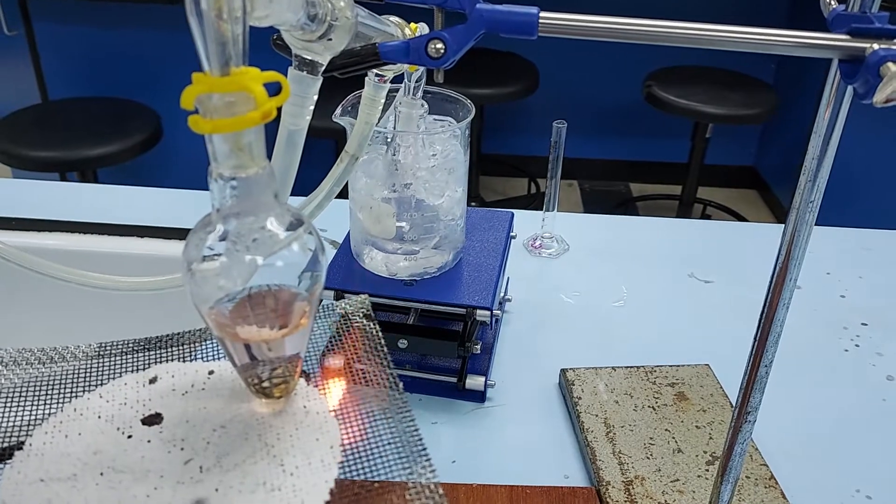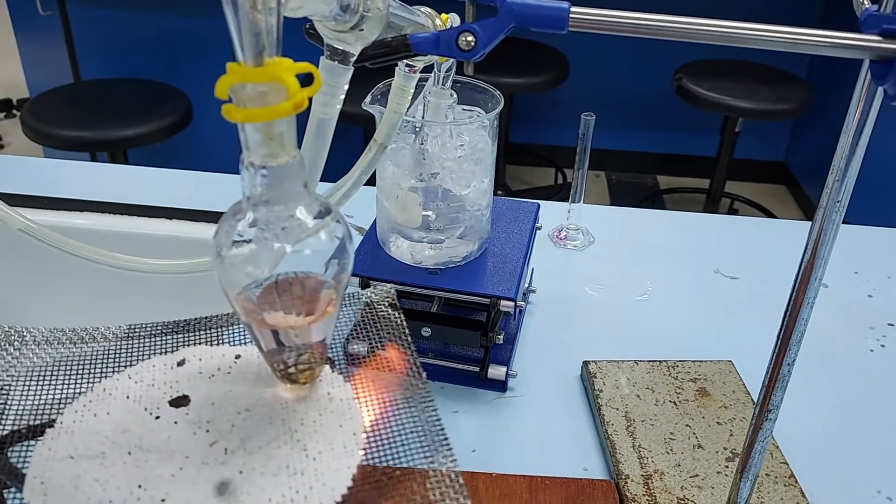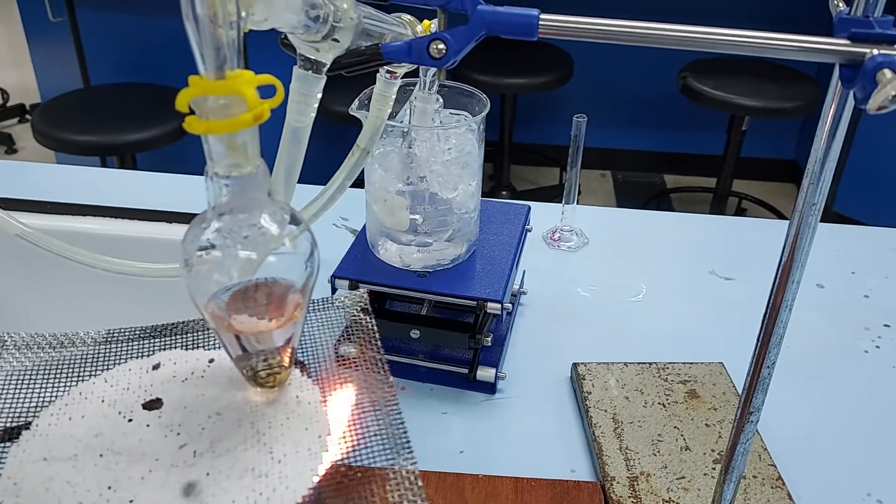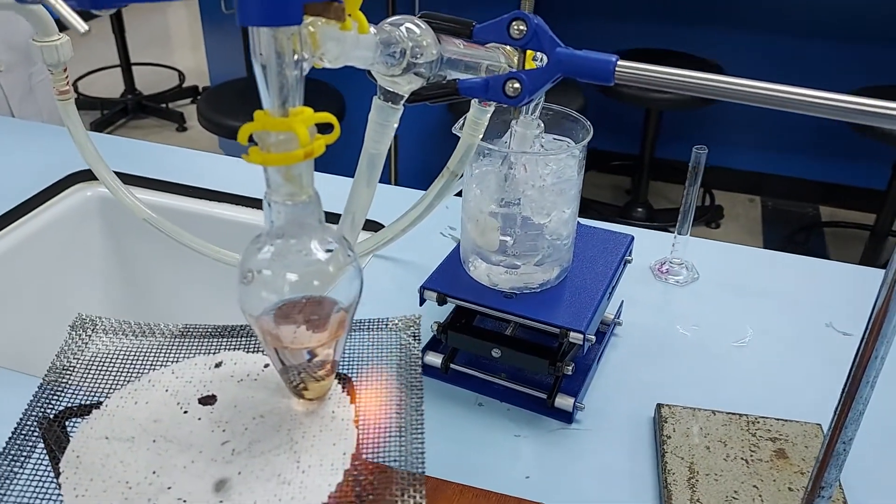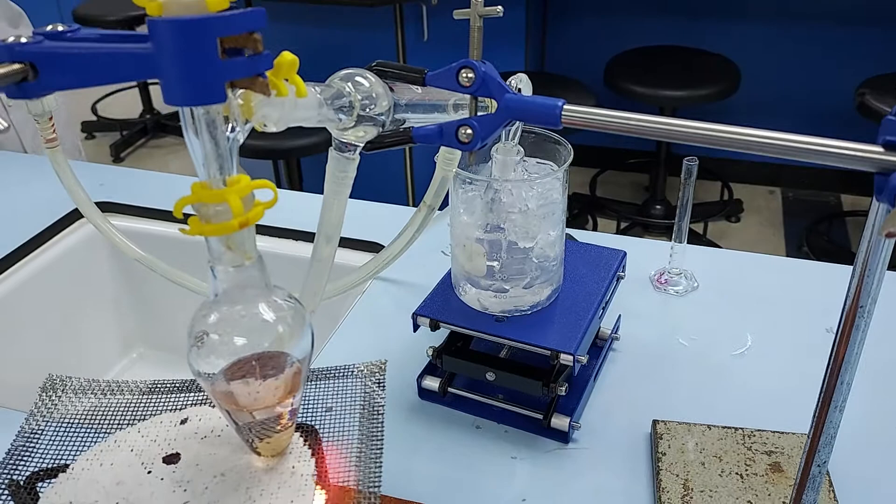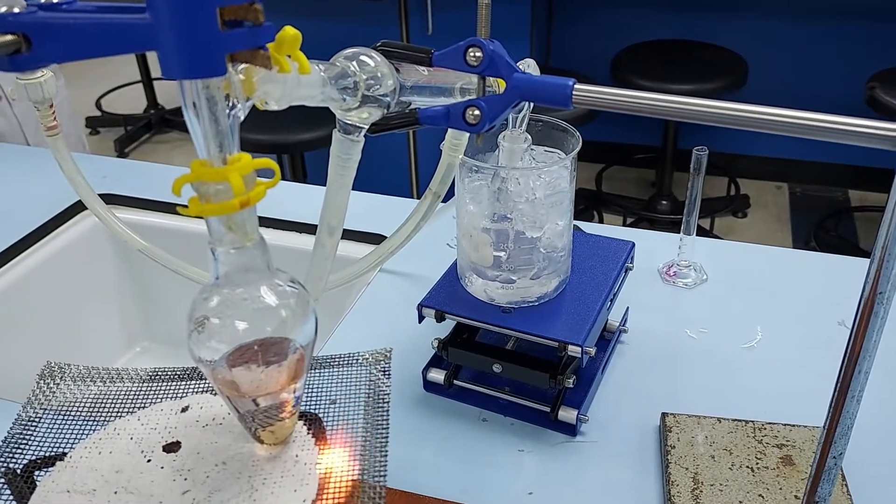We don't want that to happen, we want to make an aldehyde. Aldehydes are very volatile so they've got a low boiling point. This should evaporate and then condense in the condenser and go straight into our receiving flask.